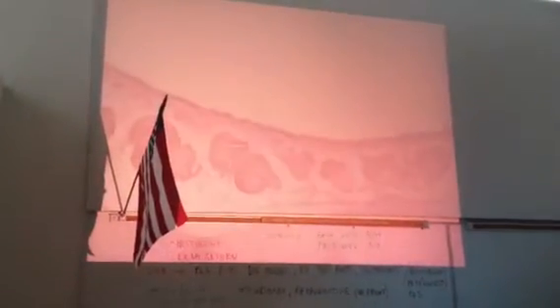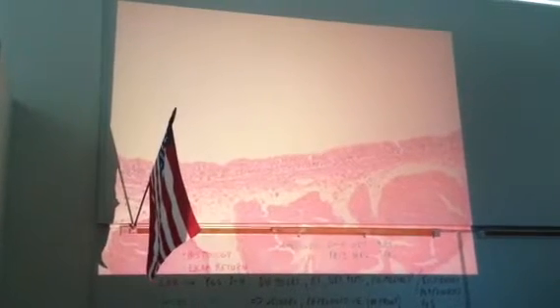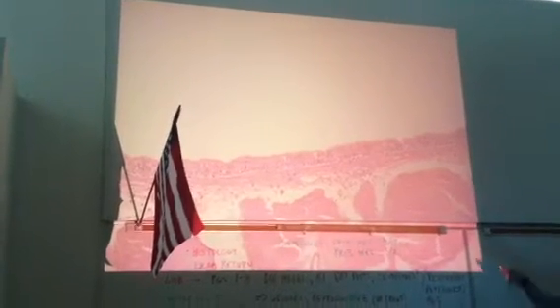Always do the slides for histology. All right, so this is trachea. This is the lumen of the trachea, this space that's right here, and the giveaway is that this is a pseudostratified ciliated columnar epithelium, and so if you go to high power, you see that. So nuclei at a number of different levels present here, and there are cilia on the surface. If you go to the highest power, we can see that.